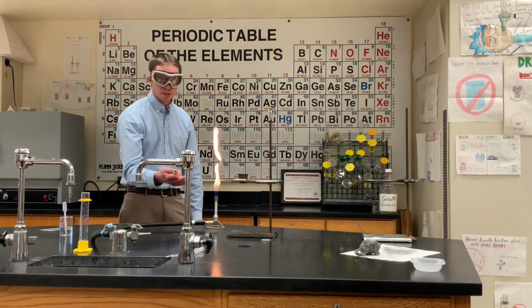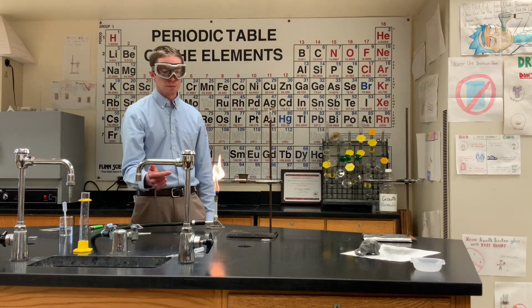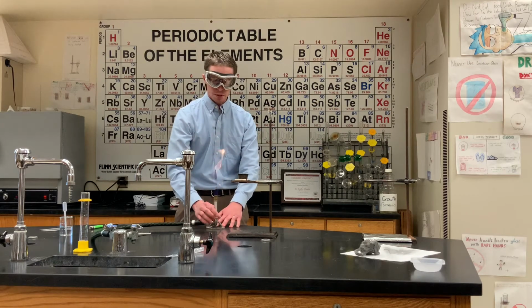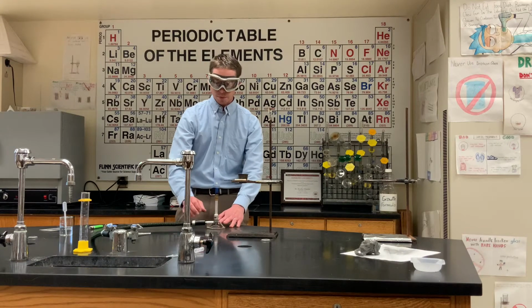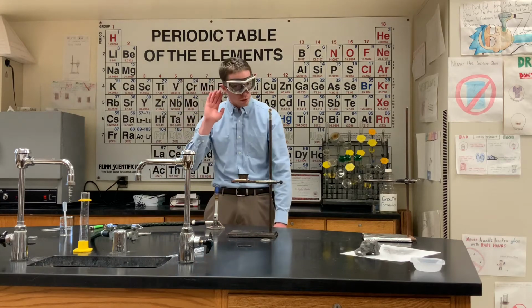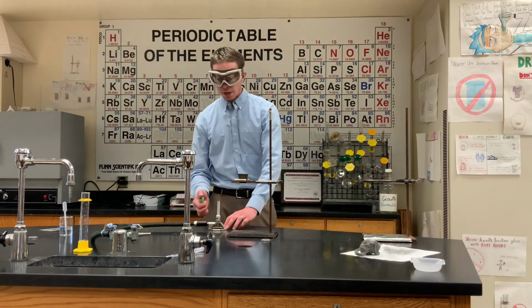If I put that under there right now, it would get carbon and soot all over the bottom of the crucible and definitely ruin this experiment. So we want to adjust this Bunsen burner so that it is properly and appropriately sized. So I've got that nice inner blue cone. I can hear a roar.